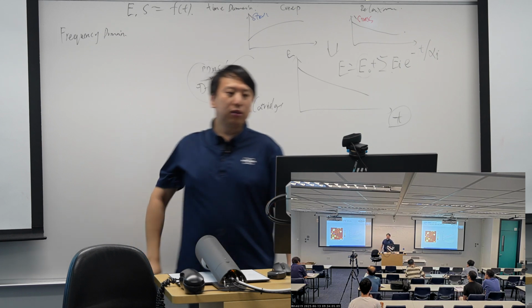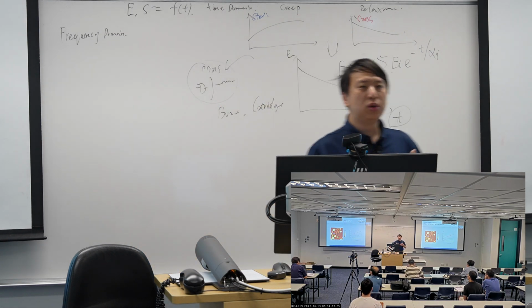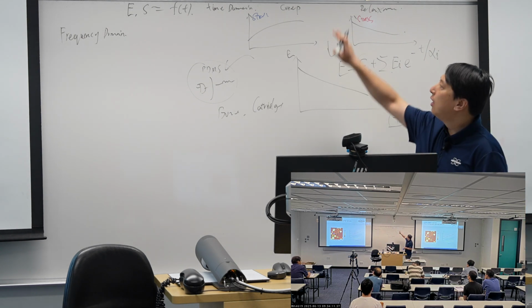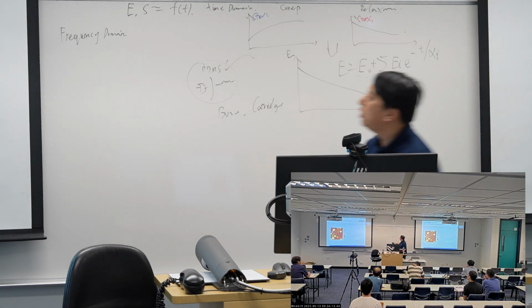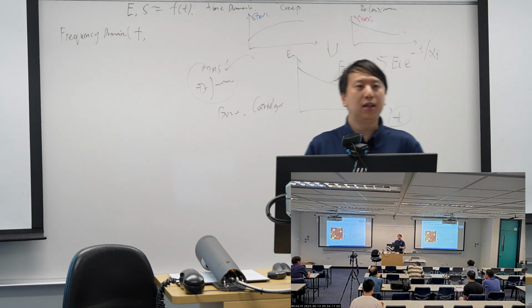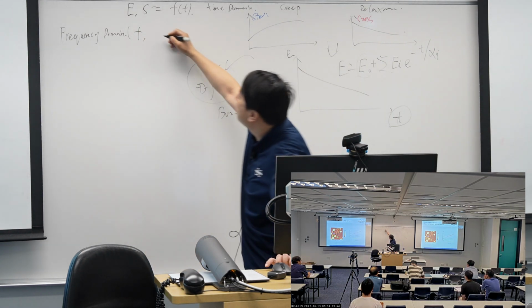And in the frequency domain, they need to introduce the time in another way, which is frequency. Or when we do it in the experiment, we introduce speed.